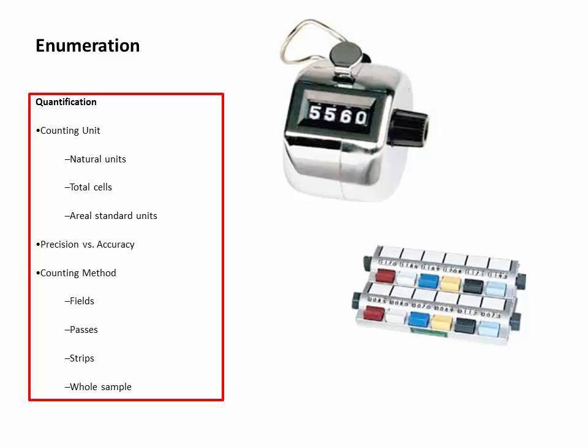Because again, keep in mind, what are we doing this for? We're doing it for management decisions. And if we're all talking apples and not apples and oranges, then we can make management decisions based upon something that's not so onerous as cells. The other possibility is to use areal standard units, which I'll explain in just a minute.